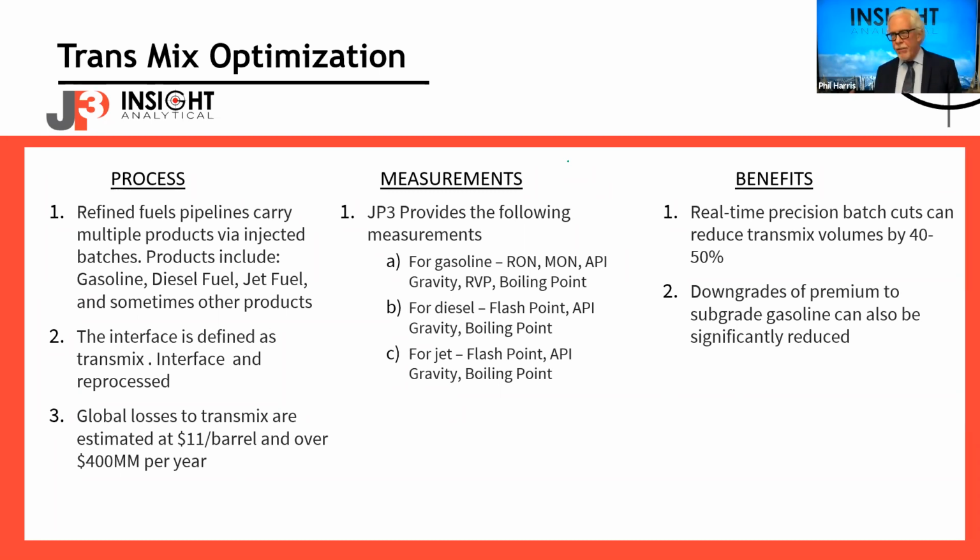And when we started bringing our first units up to Canada, or installing the first units up in Canada, we said, oh, we're going to do a natural gas condensate. Well, they started seeing the spectra and they're going, that's not condensate. It's not the condensate we see down in the States. The US had condensates way lighter than this. The other stuff looks more like crude.